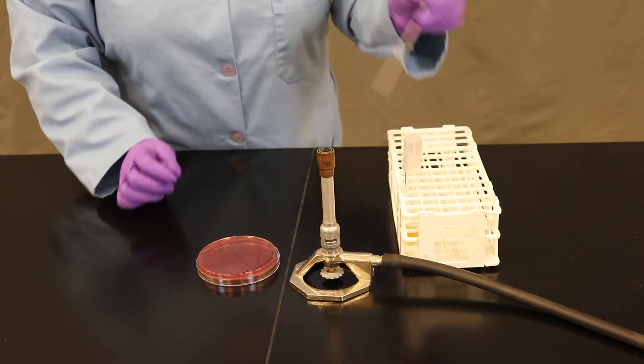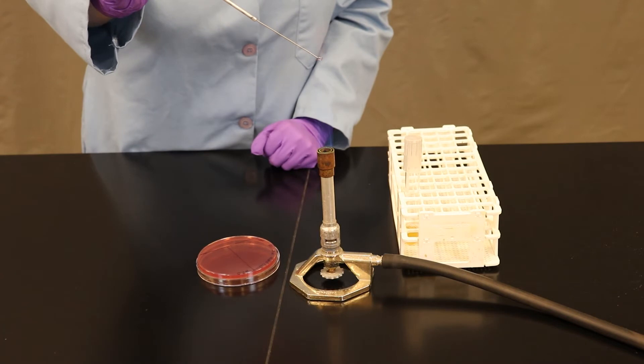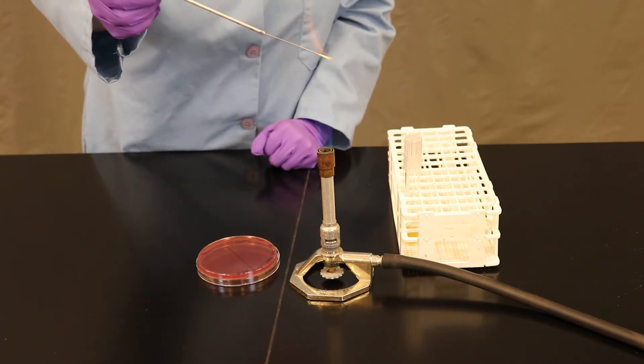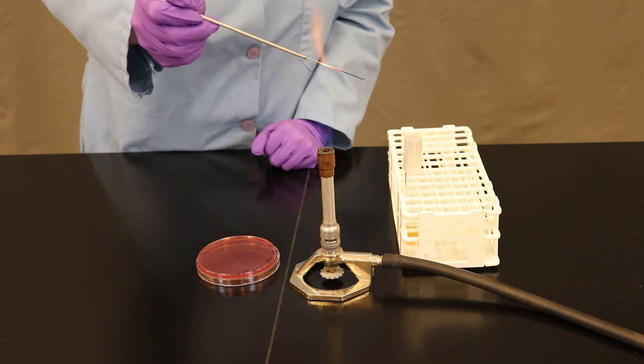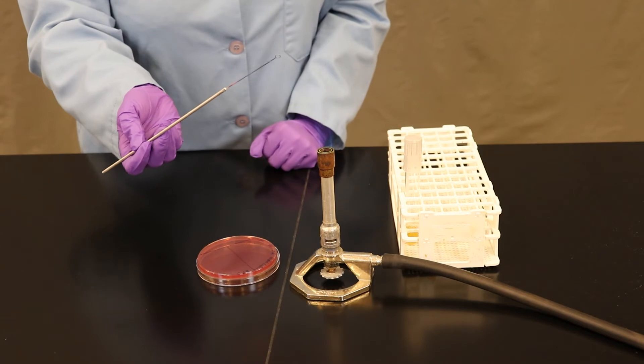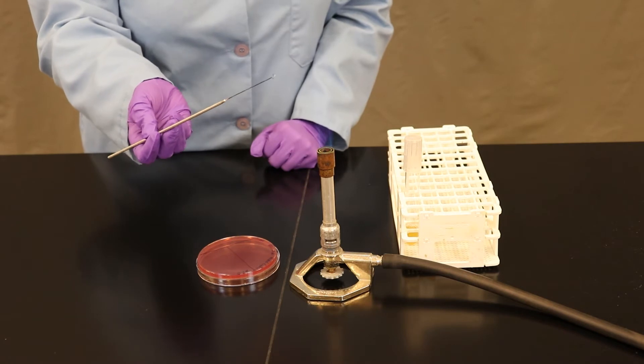Once labeled, I'm going to sterilize my loop by placing it through the inner cone, until the entire length of my wire turns bright orange. I'm going to allow my loop to cool. Remember, we don't place it on our glove or our skin, we don't cool it by blowing on it, and we're not going to wave it around.